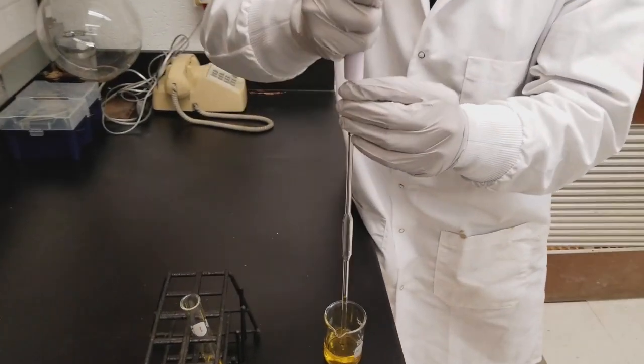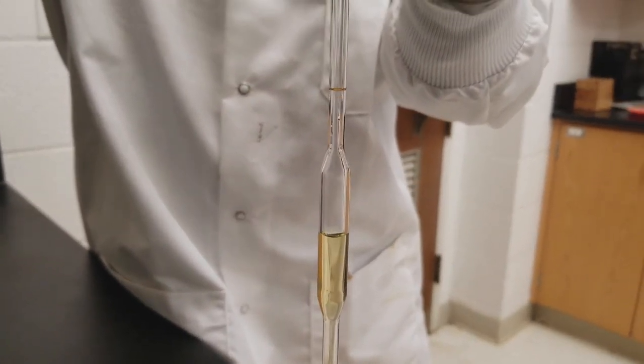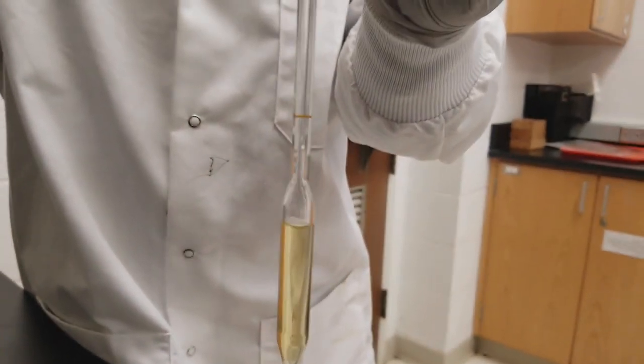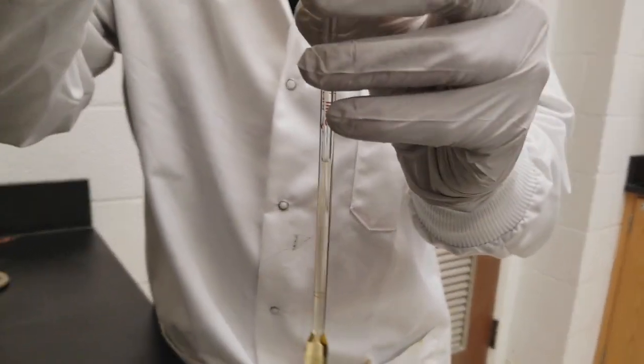Dip the pipette into the solution and start to siphon it up by gently releasing your pipette bulb. It will fill the bottom part of the pipette very quickly, the middle part a little slower, and as you get to the top it'll go quick again.